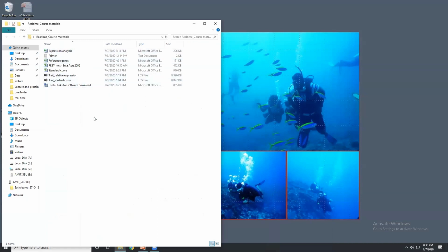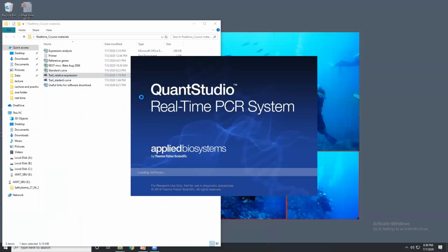have provided, or do not worry about the repetition, I will definitely do it at the end. So right now let us go for the practical analysis. So you will see that I have also shared a .eds file that will open in the QuantStudio real-time PCR system, right, by Applied Biosystems.